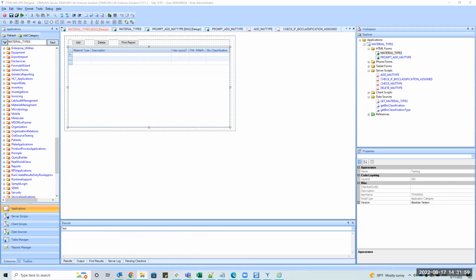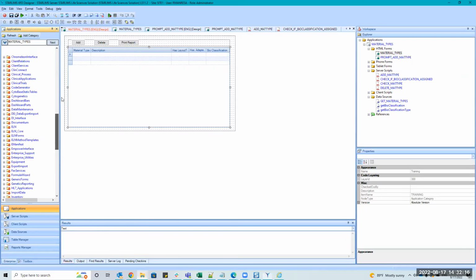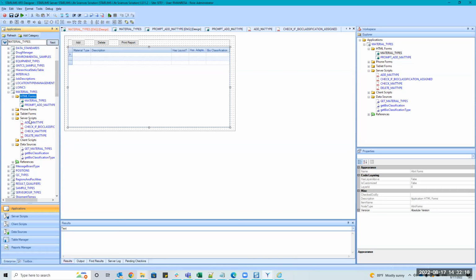Okay, so with that being said, I think we can finally get started. Any questions on the help manual or the designer itself before we even begin? I know you guys saw a little bit of it. Any questions on this simple app here? Forms, server scripts, data sources, are those concepts okay from the stuff with David, or is it new?